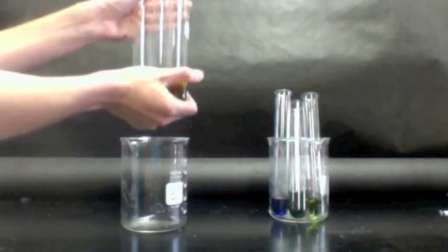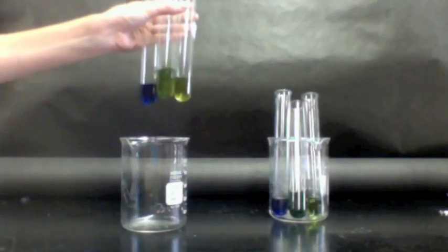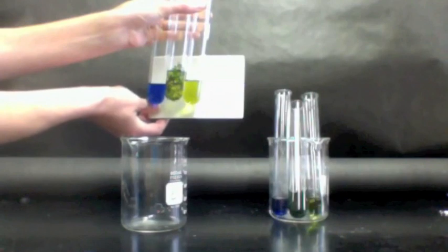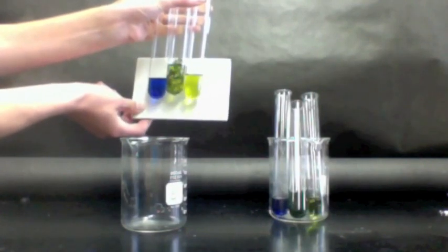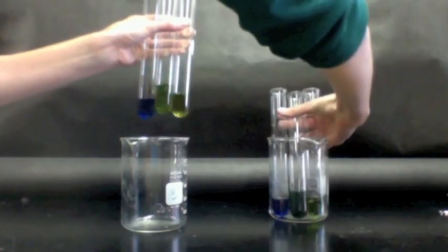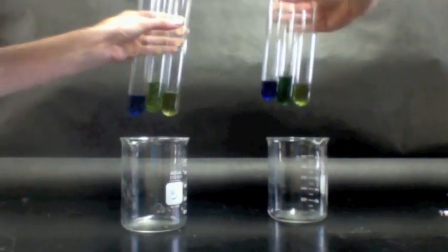Here is the one that was in the dark. And again, you can see the one with the plant in it is in the middle. And that one, you can take a look at the color.